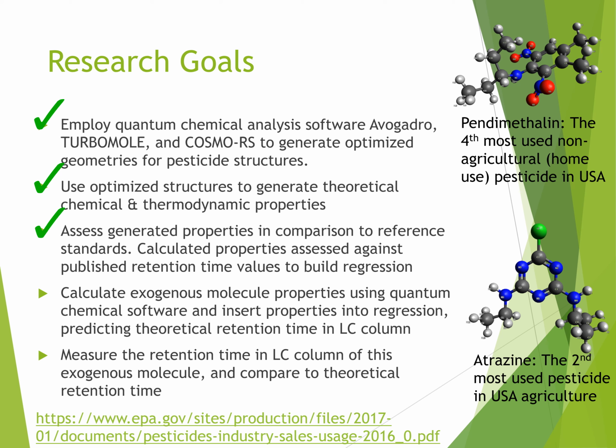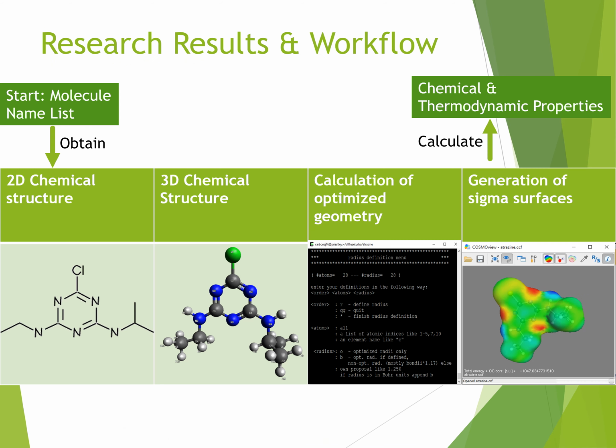Exogenous molecule properties were then calculated using quantum chemical software, and these properties were inserted into the regression, predicting theoretical retention time within the liquid chromatography column. In the future, retention time in the liquid chromatography column of exogenous molecules will be measured and compared to the theoretical retention time. The general workflow of this project included converting molecule names into 2D structures, which were then built in Avogadro software into 3D, roughly optimized structures.